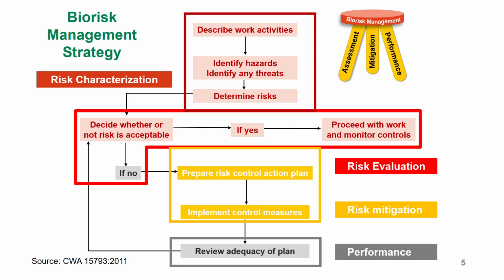But what if you put up your biosafety cabinet class 3, you do these facility features, but then the risk is still unacceptable? The risk has reduced, but the level of that risk is still unacceptable. So there's a positive, it has reduced. You've at least reduced the risk, but the risk is still unacceptable.